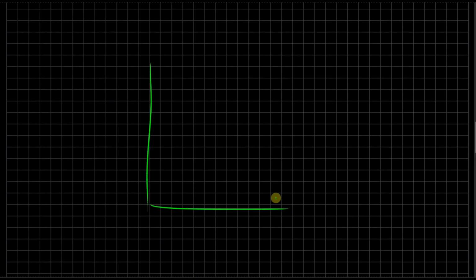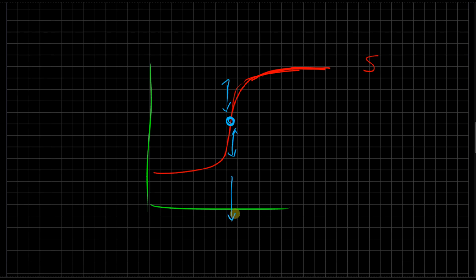The other thing that I wanted you to know is whenever you're making your titration curve for both weeks, make sure you have a nice smooth curve and you have the full S shape. So I see some students stop the curve there. No, don't do that. Make sure you get a nice completed S shape until it's been flat for a little while. You want the full S shape of your titration curve and to be able to pick the midpoint of this vertical region to give you your endpoint for your titration. All right, I will see you all in lab.